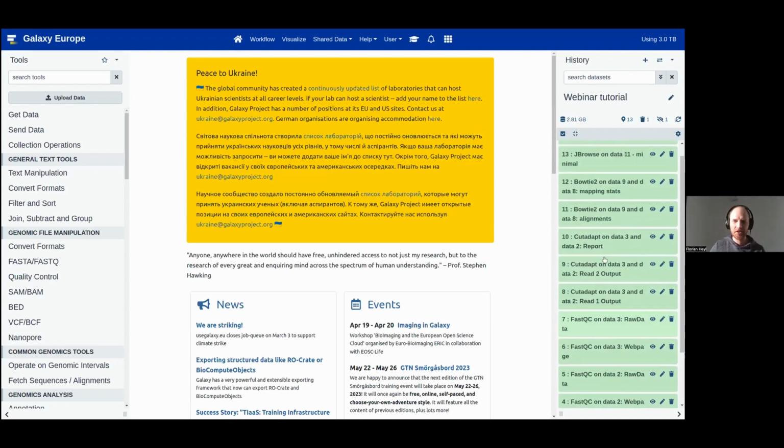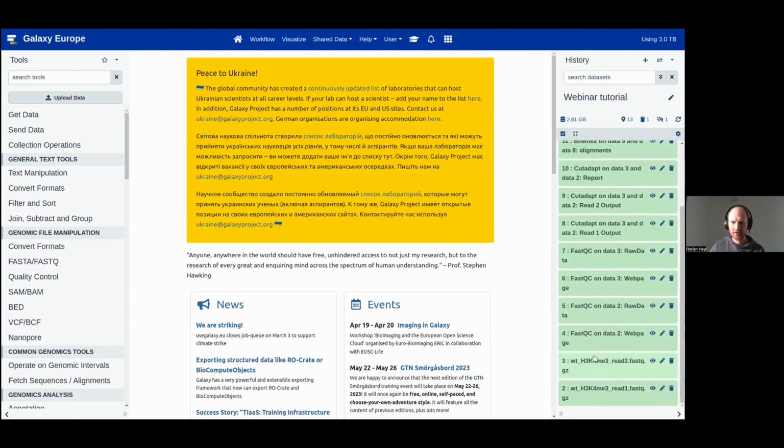You see right now that everything is green. So I mentioned that all these steps are data processing steps, but technically it's your data sets. Either it's the input data, so your raw data, which is here two FASTQ files, or some resulting files from the tools. And this can be green, meaning your processing step was successfully finished.